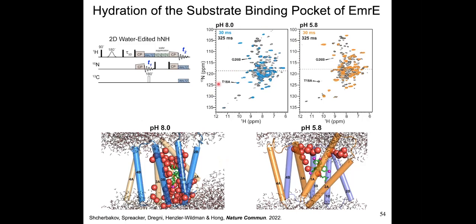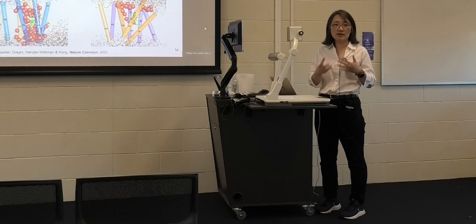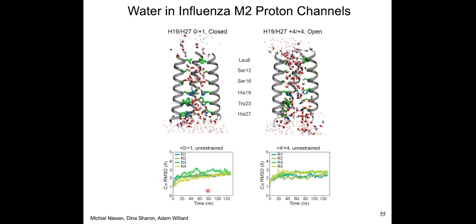And it comes out in agreement with the experimental data, which is basically saying at the high pH, there's a bit more water transferred intensities, and there's more water molecules in the high pH channel. This class of experiments all basically answer the question of how water accessible or how water exposed are your protein residues. So that's one type of question.